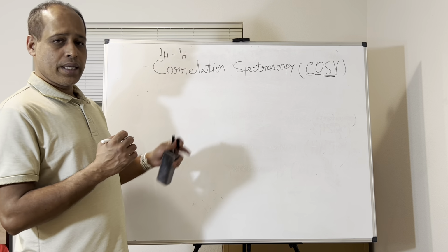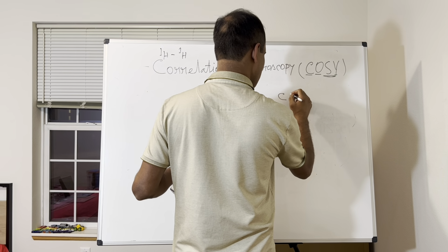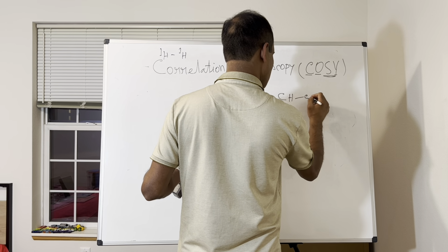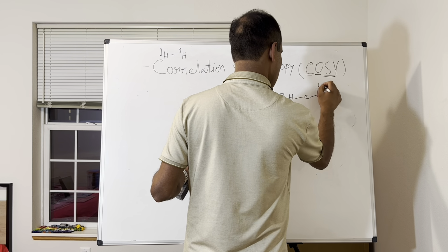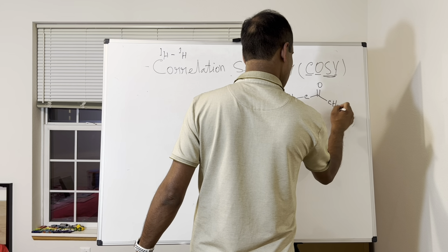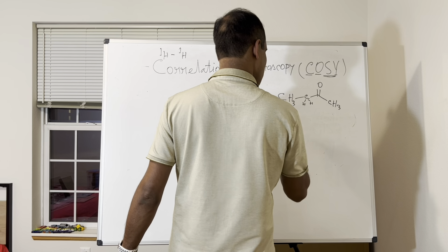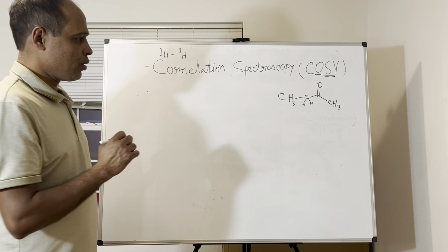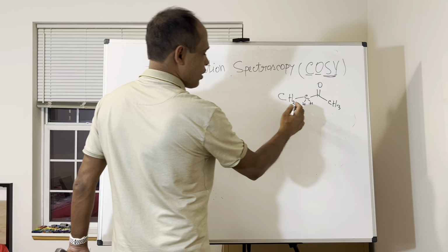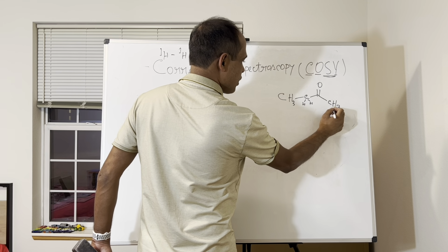Now COSY. Suppose you have a molecule. So this is a molecule. How many types of proton are here?